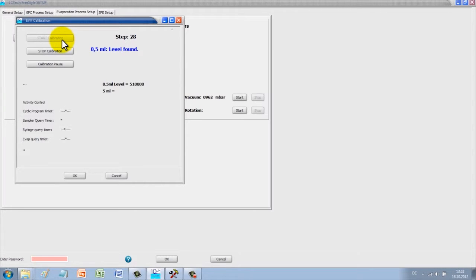In that way, large volumes can be concentrated under vacuum first, and then the remaining milliliters can be concentrated to the required end volume using nitrogen.